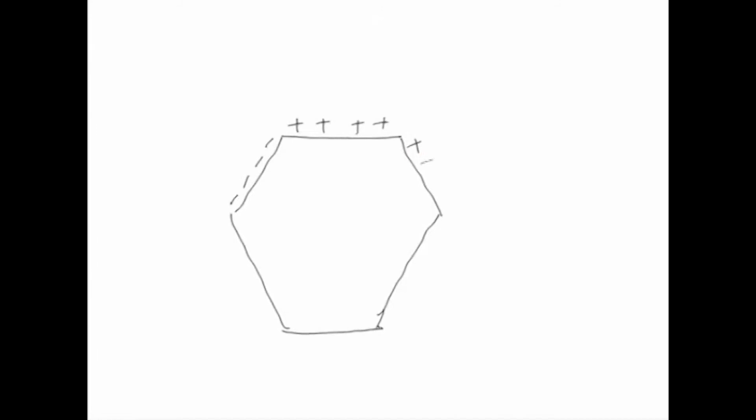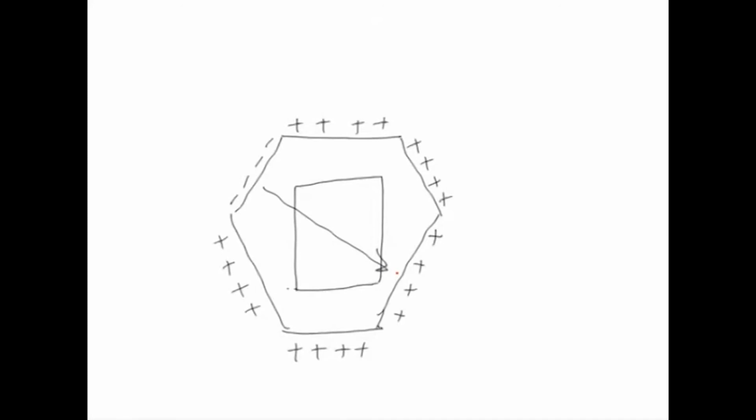These electrodes are made of platinum wires. So what you can do is, if there is a DNA molecule here, and a gel placed in the center of this electrode array with the samples placed in here, then the force on the DNA will be in this direction, and when you switch on another electrode, in a second direction, from the center this is plus 60 degrees.